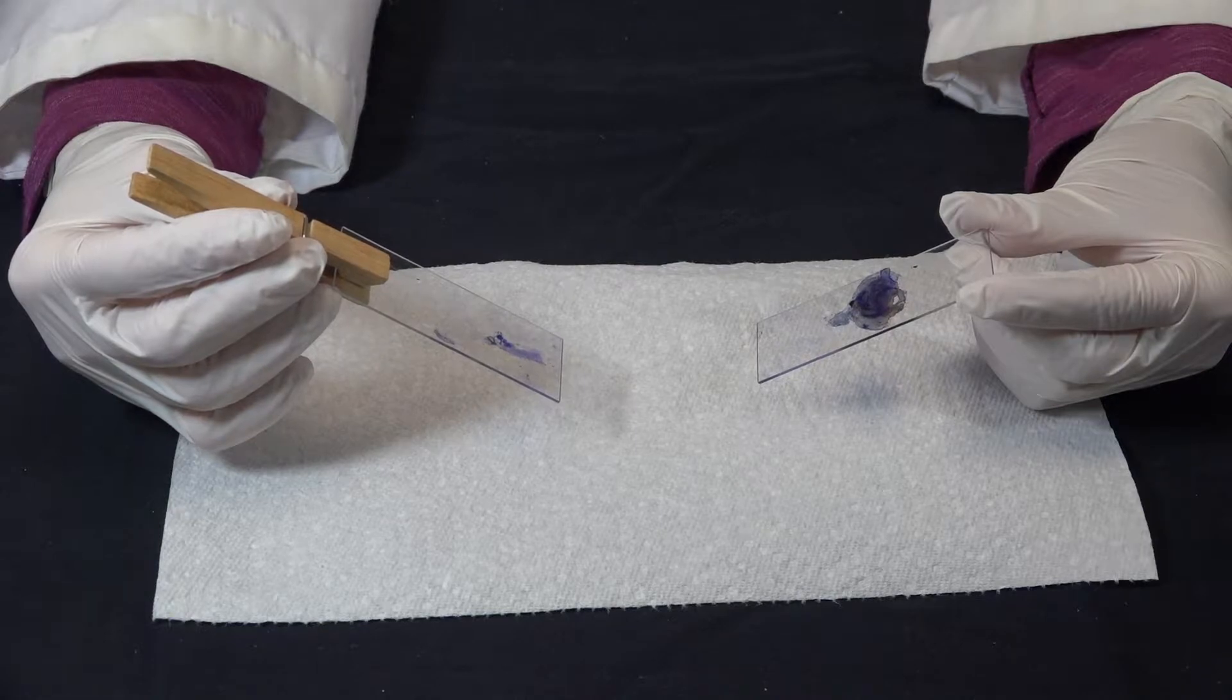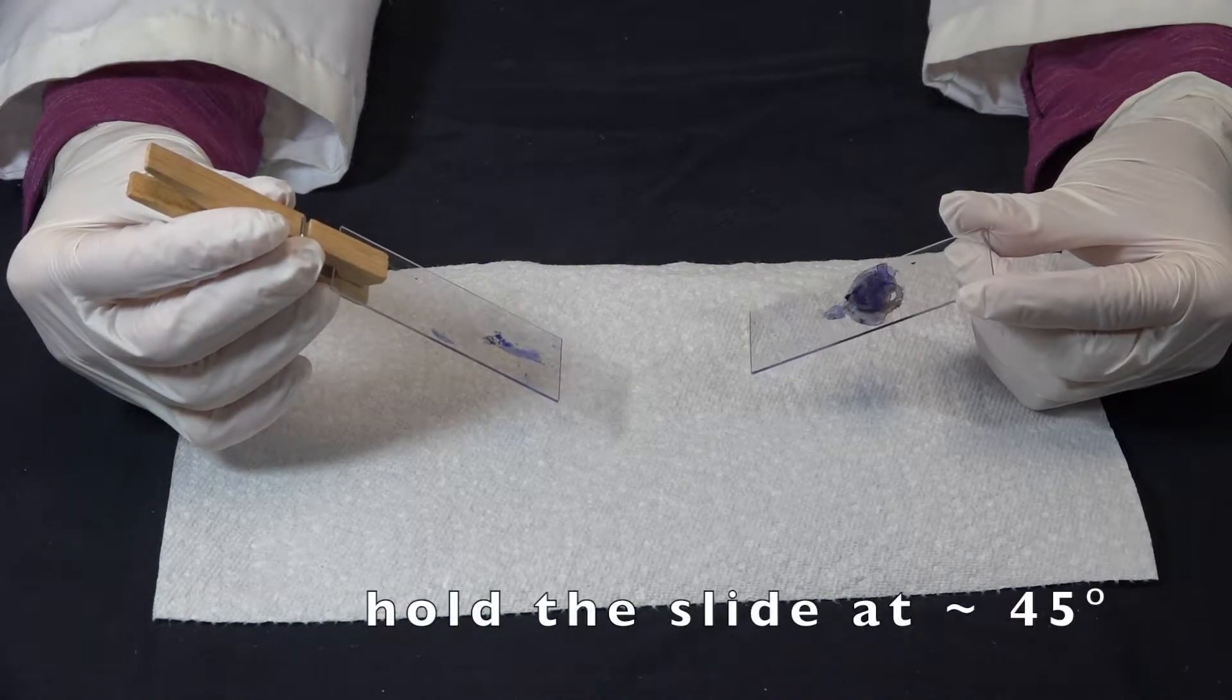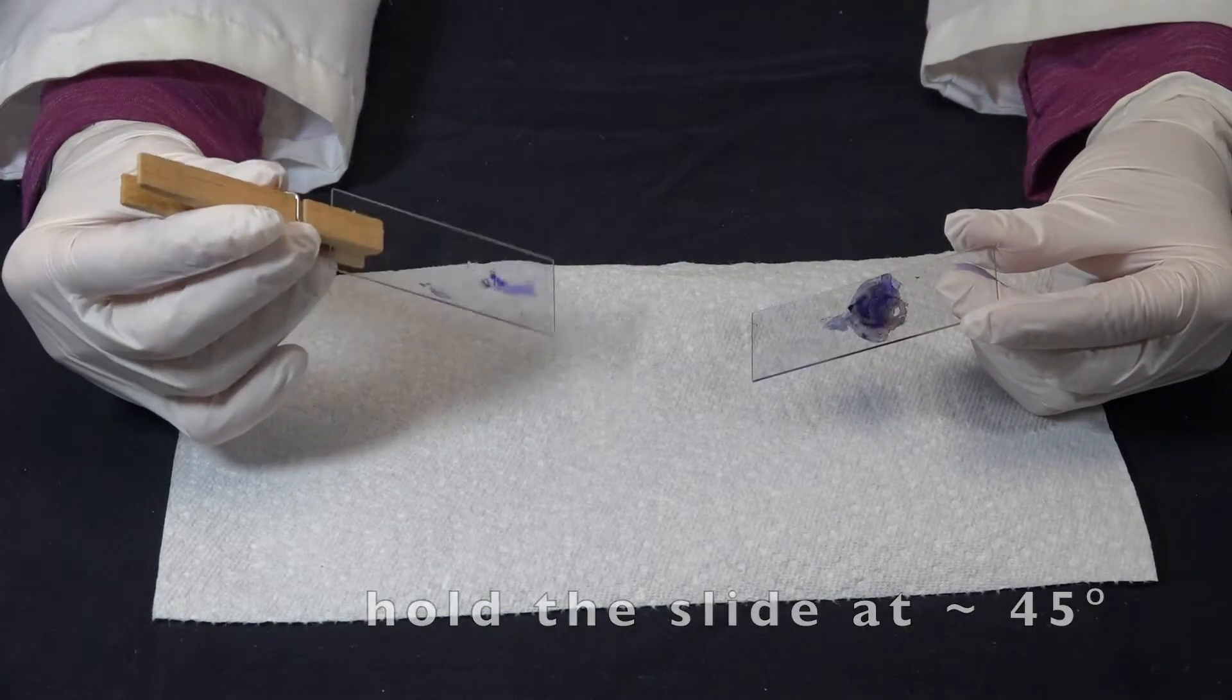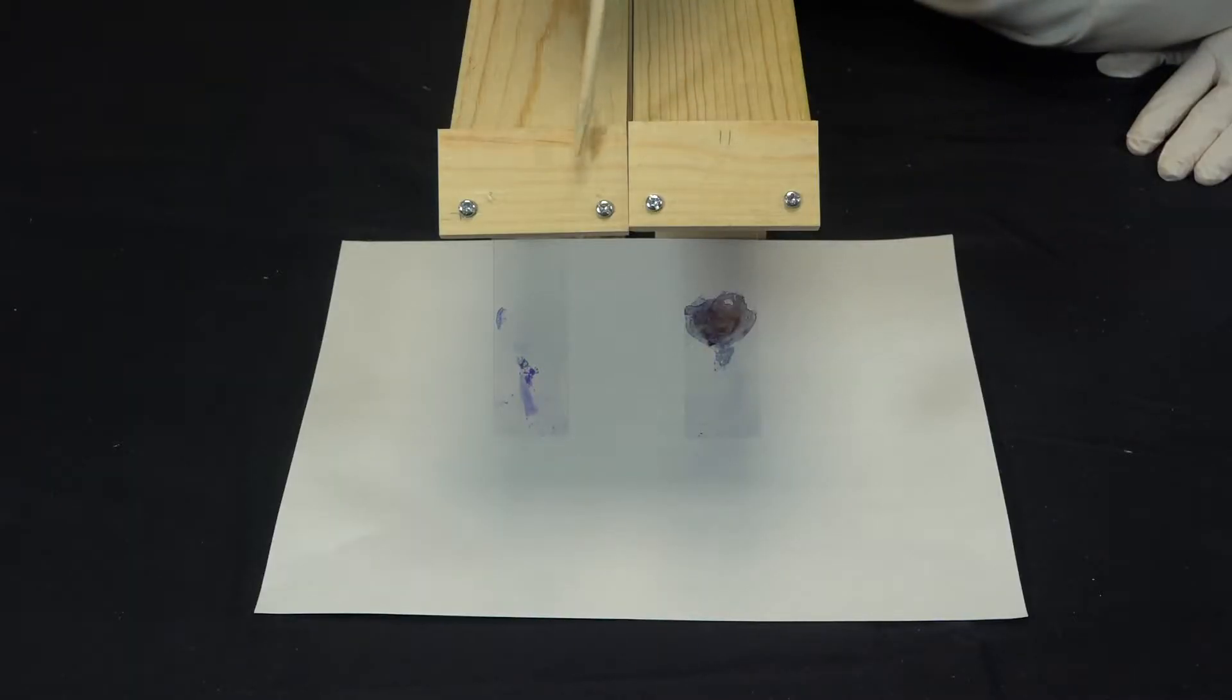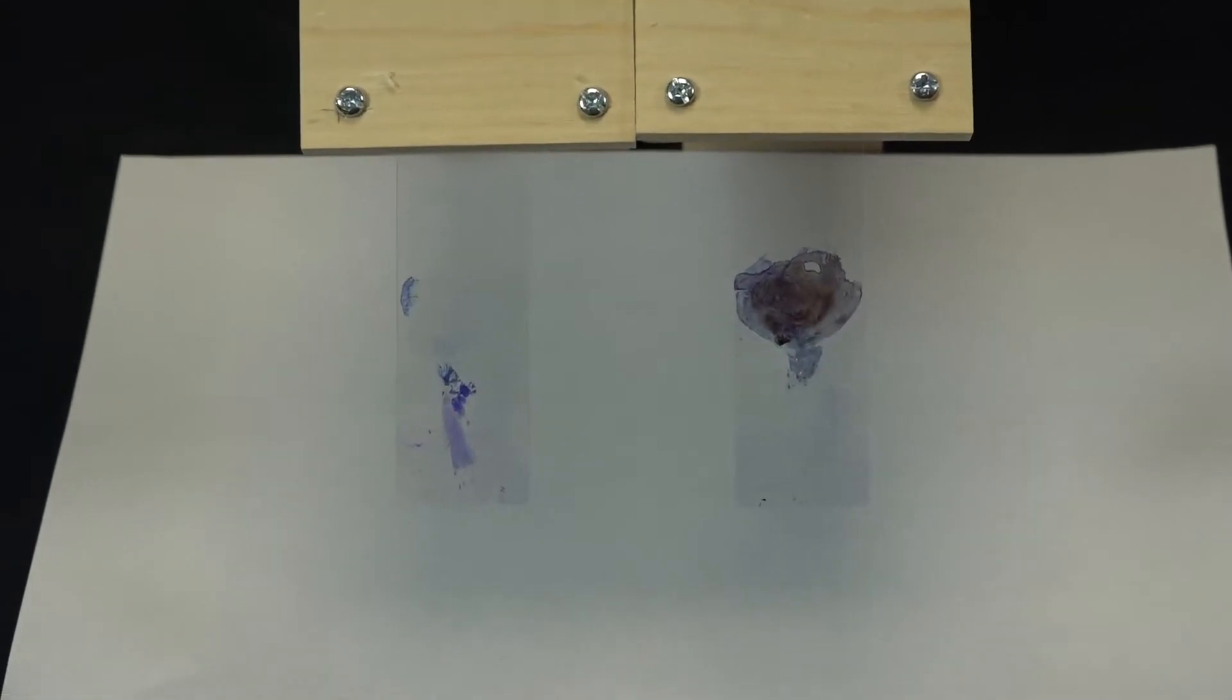Normally, for the decolorizing step, you would hold the slide at a 45 degree angle with your hand or a clothespin. But I've mounted the slides in a special holder to make the decolorizing process easier for you to see. Notice that one smear is much darker than the other.